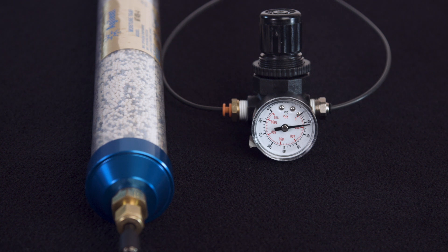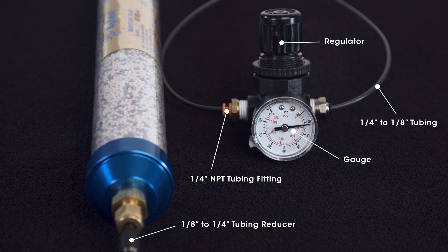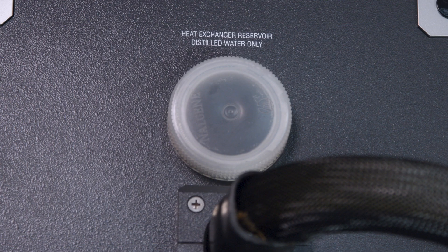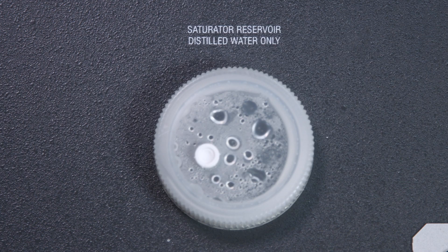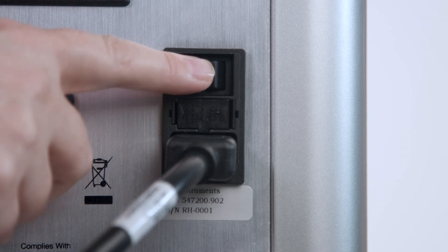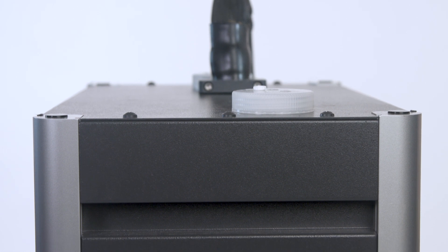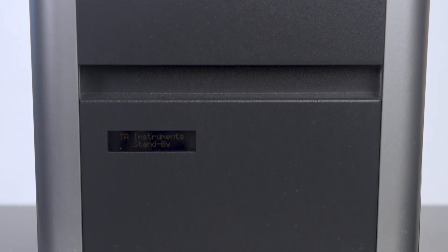For general routine setup, first check and make sure the humidity accessory is connected with the dry nitrogen gas with a pressure of 20 psi. Check and make sure the heat exchanger and saturator reservoirs are properly filled and the humidity generator is connected to the back of the instrument electronic box with the RS-232 cable. Then power on the RH accessory. The LCD screen from the front of the humidity generator should show TA Instrument standby.